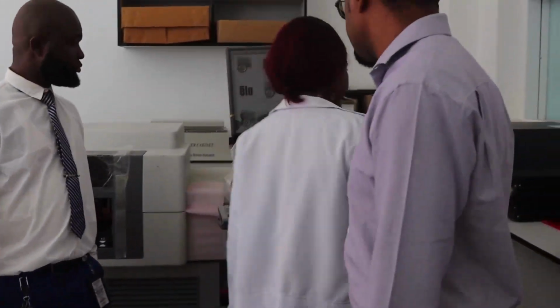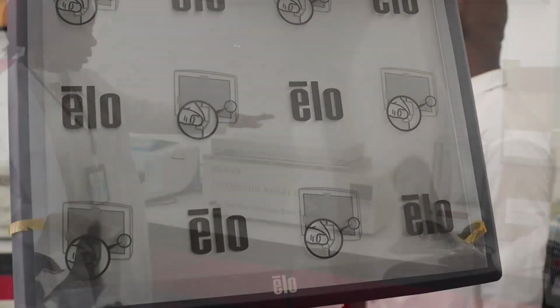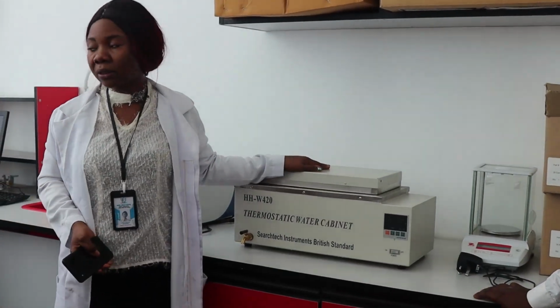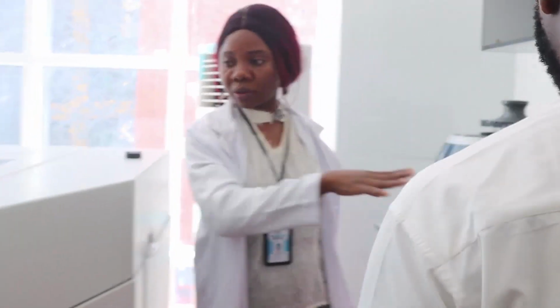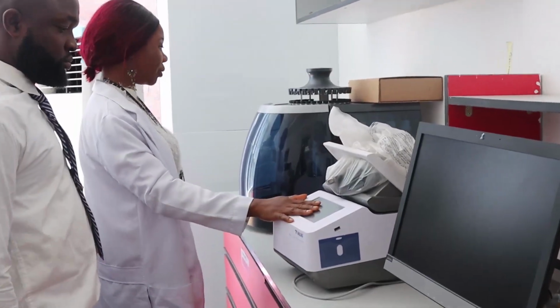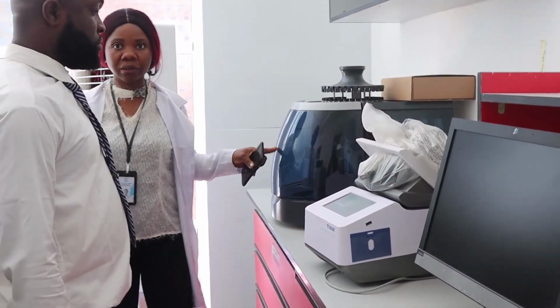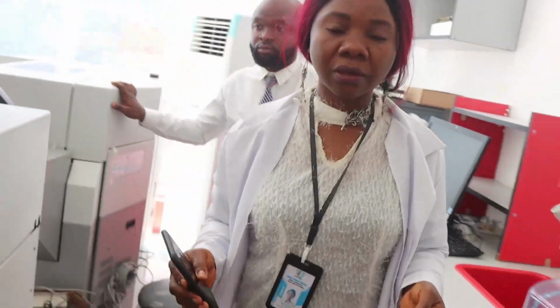We have our pump model. These are our water bags. This is our thermostat water cabinet, and this one is for this machine, and this is also a PCR system machine that we use. It's another PCR machine. This machine and this one are almost the same, but with different functions. So this is chemistry. We have a lot of equipment in chemistry, just as in the other units we have gone through. Umahi Federal Teaching Hospital is well equipped.